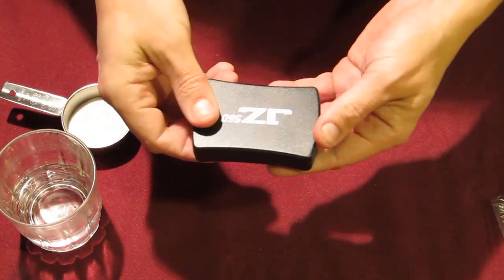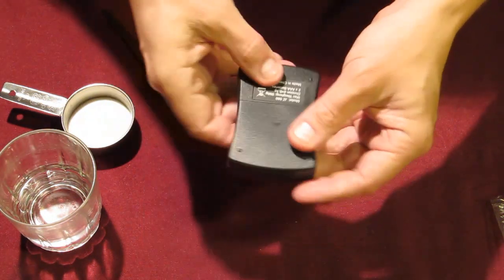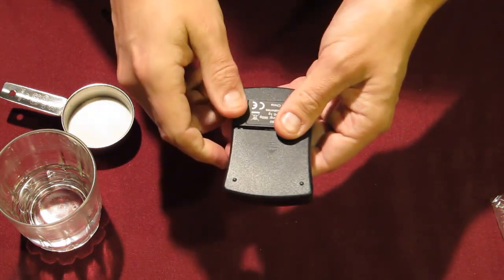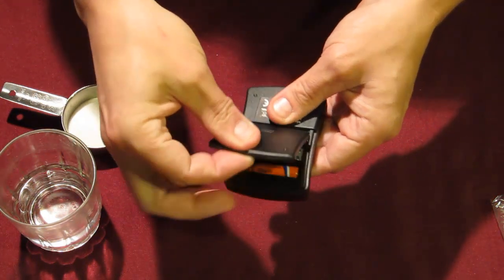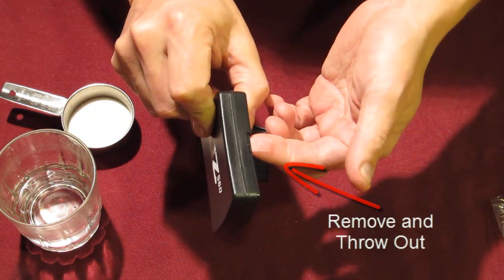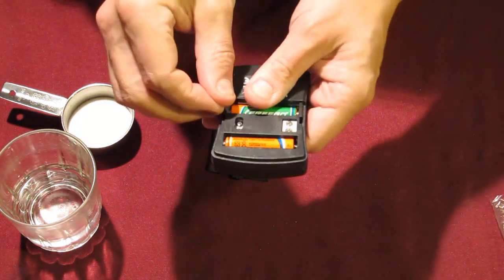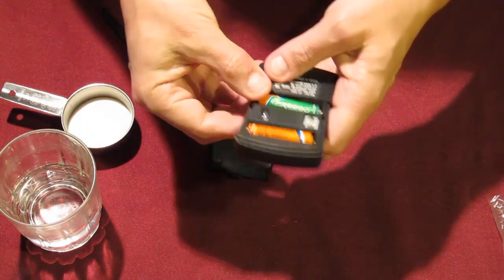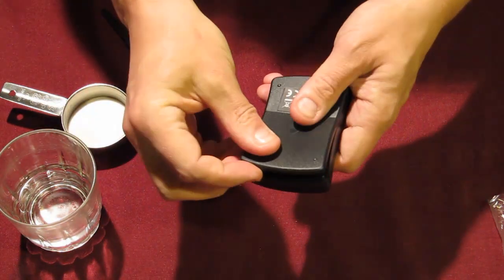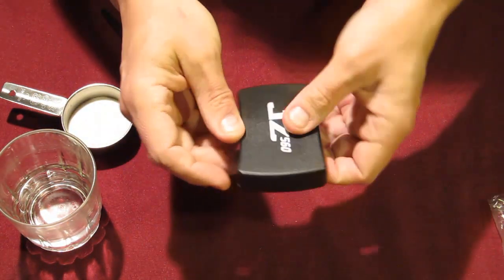The first thing you need to do when you get your scale is to remove the piece of plastic inside the battery case. Take the back cover off by pressing down lightly, sliding it a few millimeters, and lifting the cover off. You'll see a piece of plastic in there — this protects the batteries from discharging during transportation, which makes sure you get fresh batteries. Simply pull that piece of plastic out and throw it away, then reseat the battery back into its place and reattach the back panel.